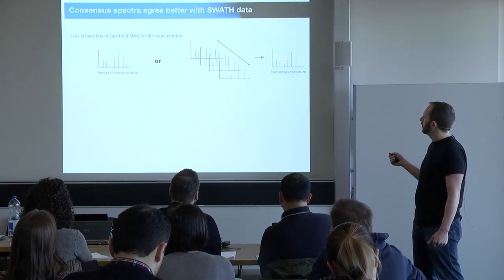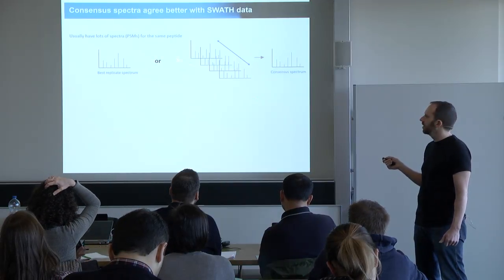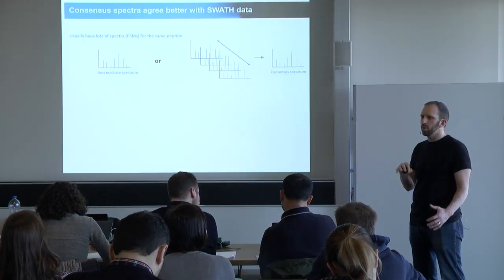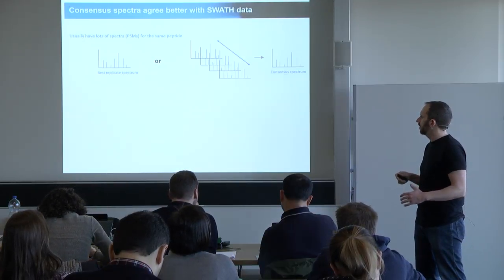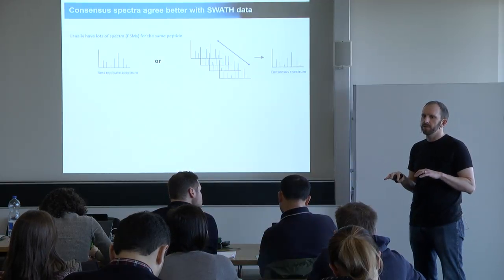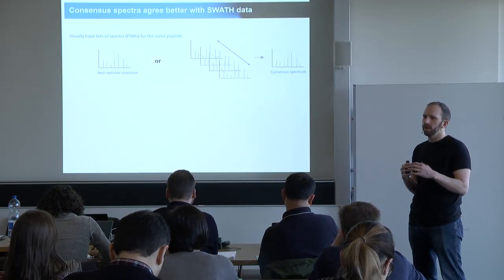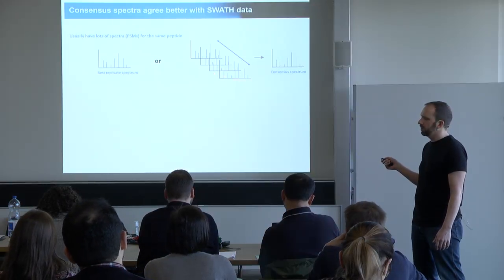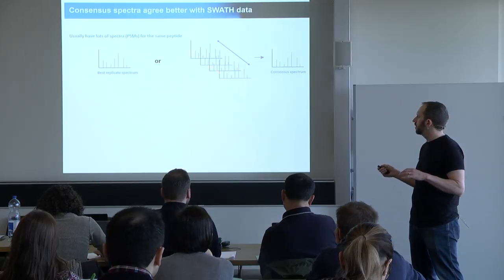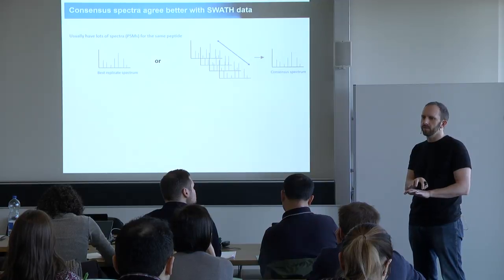And so we keep all the peaks that are the same, the relative intensities are some kind of average over these, and if there's one spectrum in here which really doesn't look like all the others, that might have been a mistake, then there are some quality control procedures to kick this out. It's also possible that these spectra came from different types of samples, right? So one might have come from a cell line, and one might have come from another sample, like a tissue sample, where you want to combine the library. And so some of these might have different interferences, they're in different backgrounds. So there may be fragments in there which are in one but not the other. But what you really want to keep is the signal from the peptide.